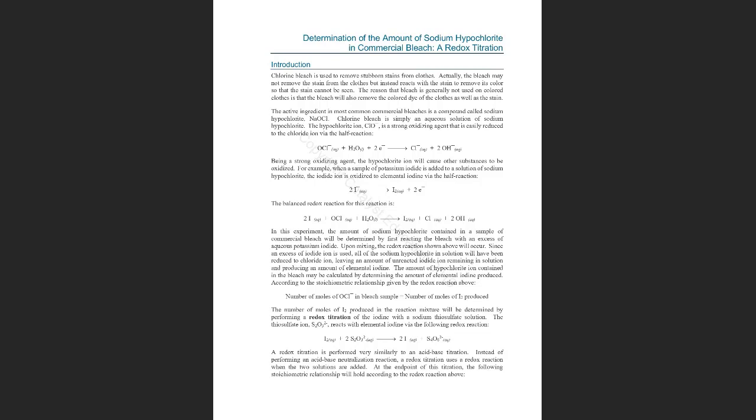The active ingredient in bleach is sodium hypochlorite. Here, sodium hypochlorite. This is the active ingredient in bleach.